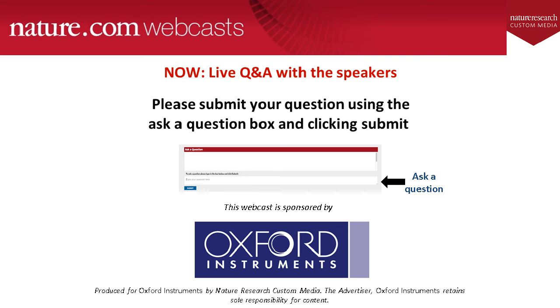So it opens up the door to doing X-ray microanalysis on samples that have already been prepared, so you can get more information from any blocks that you might have that have previously been imaged with TEM. And also because a standard prep is fairly routine, it makes it an accessible technique. And as I said, it's compatible with TEM as well, so you can get the maximum amount of information, hopefully, from your sample.